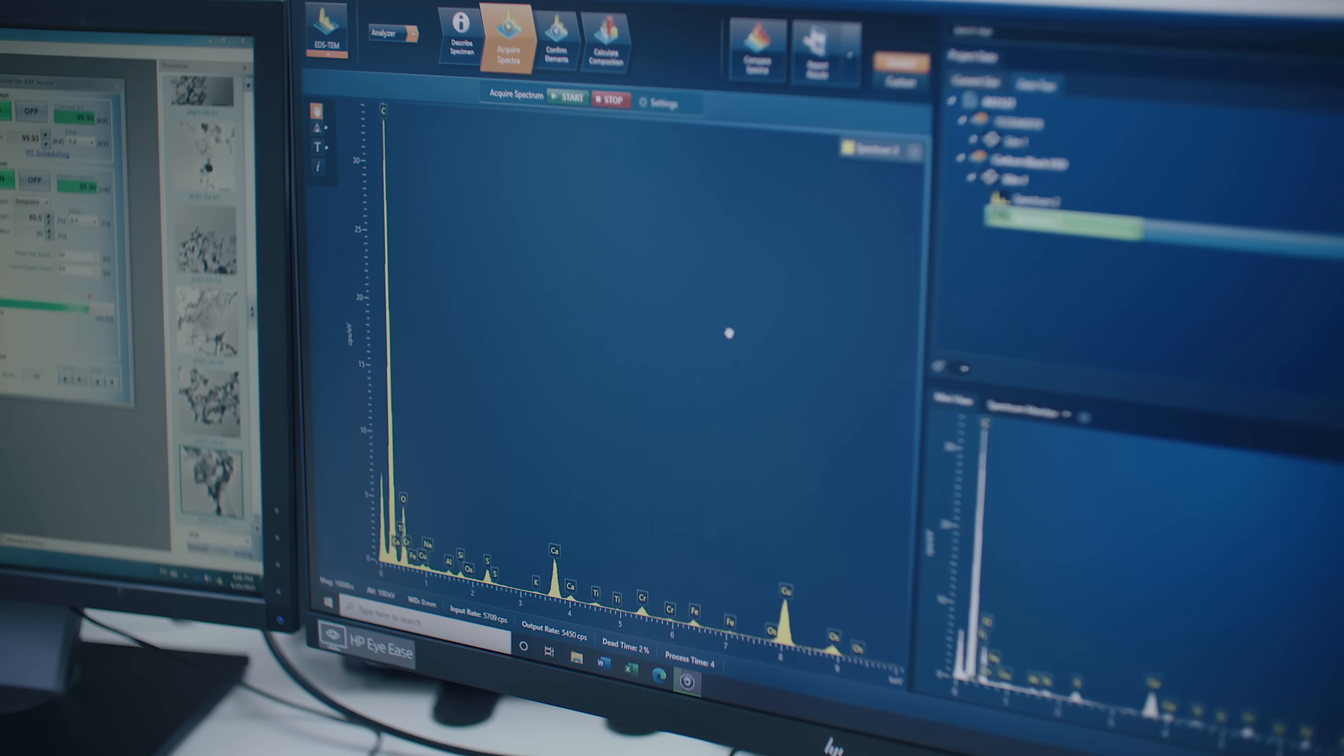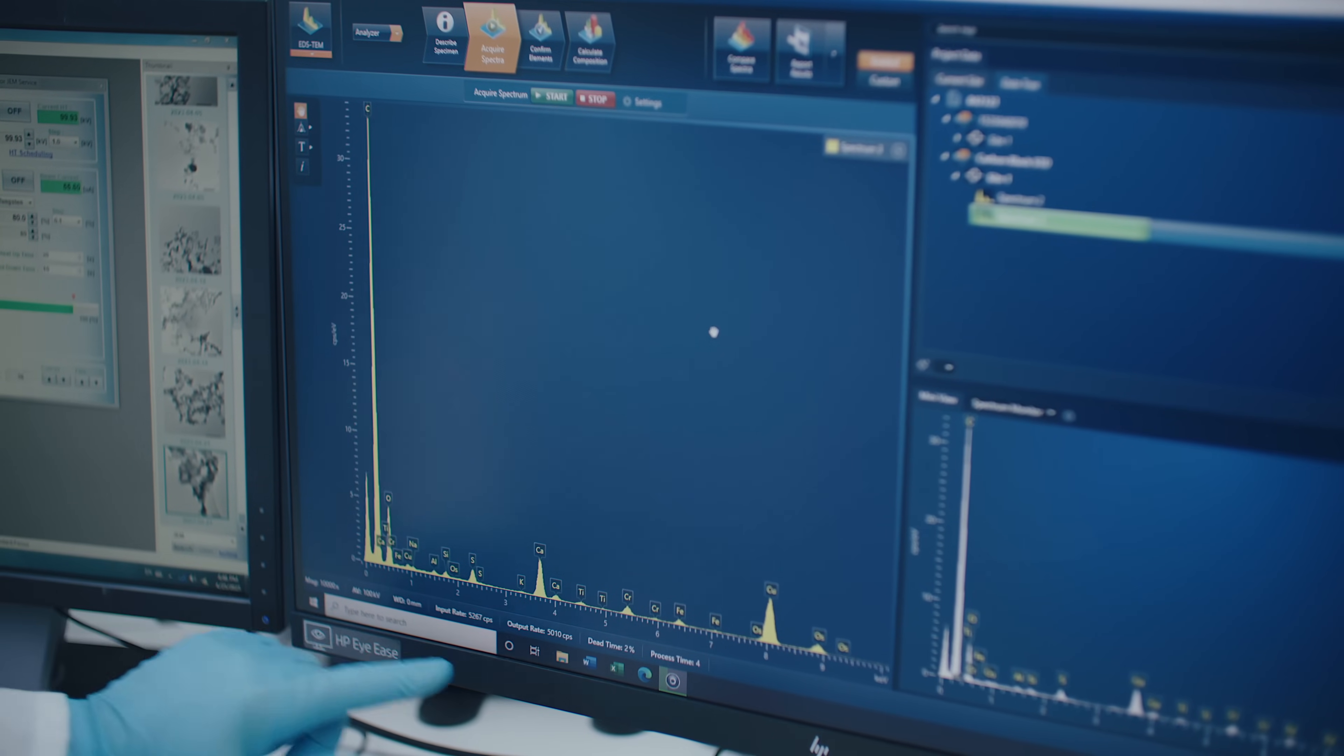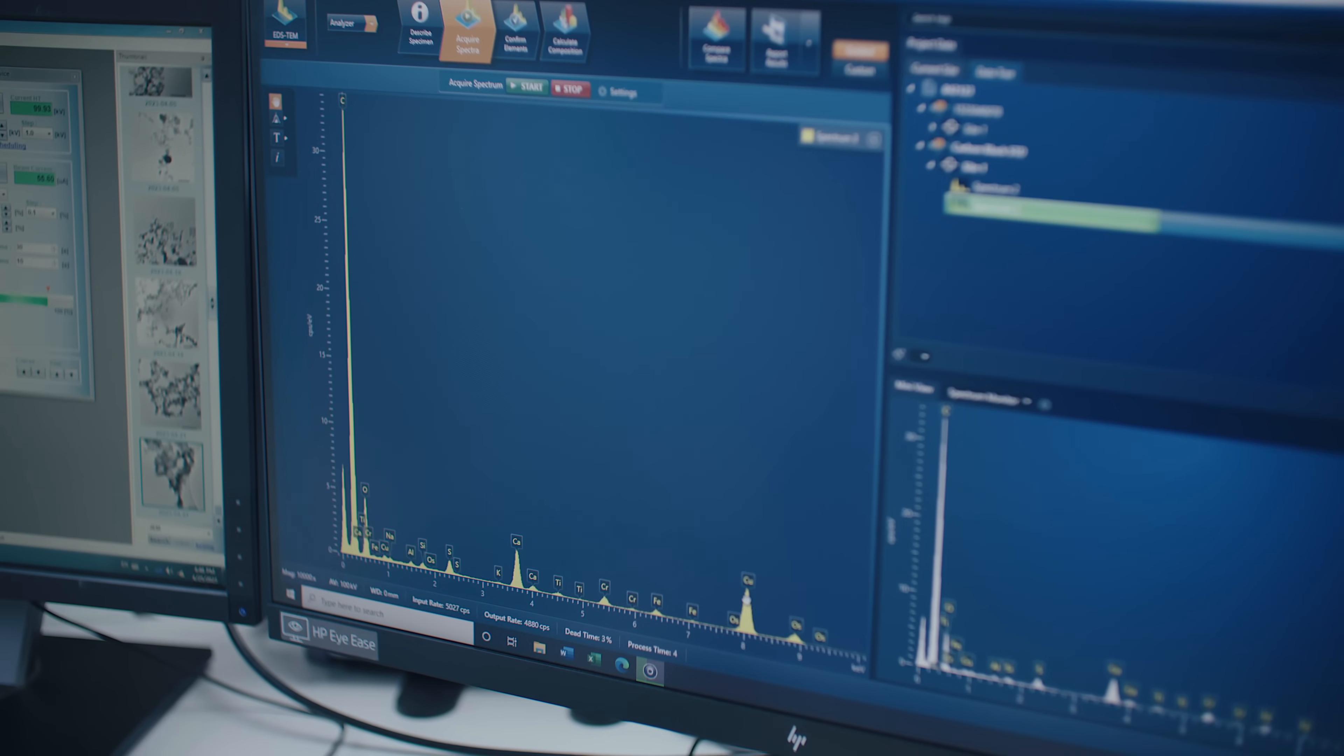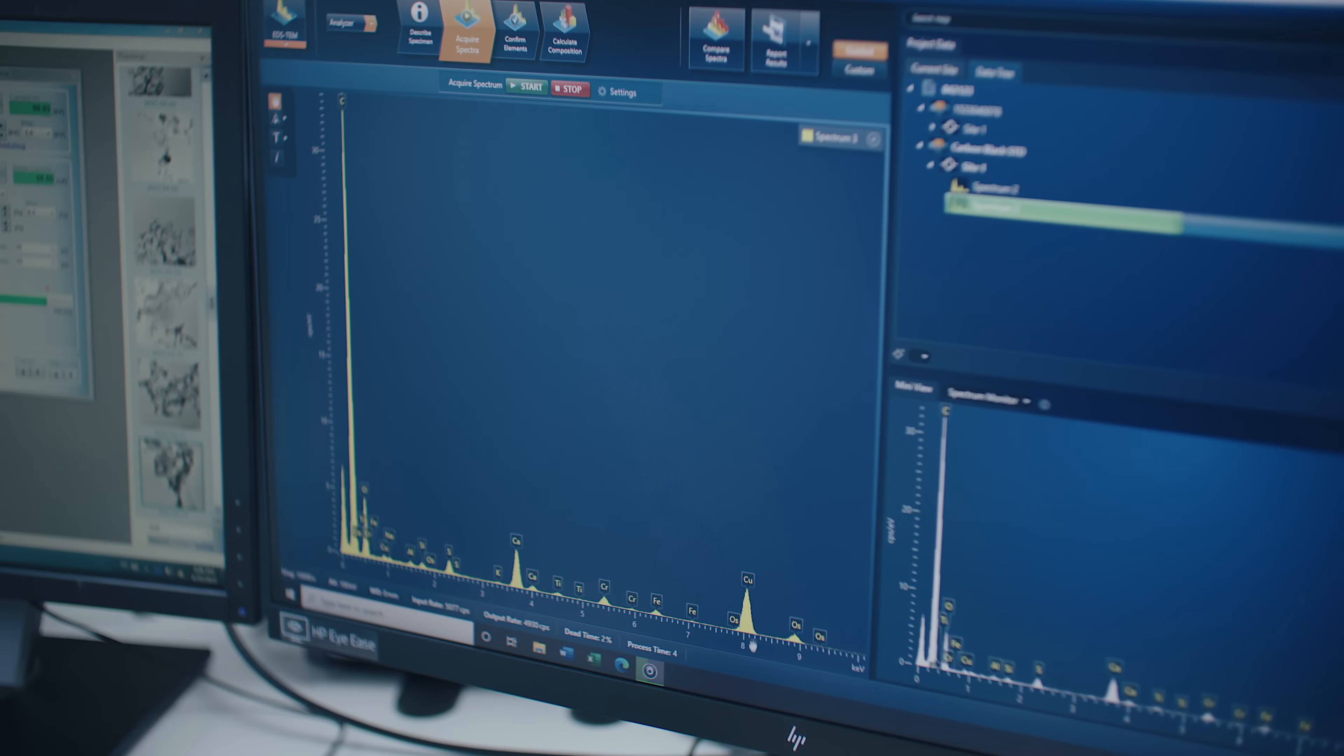So for this sample, we have a large carbon peak, a smaller oxygen peak, small calcium peak. Normally we ignore the copper peak here because the grid that the sample is mounted on is made of copper and that's what usually shows up.